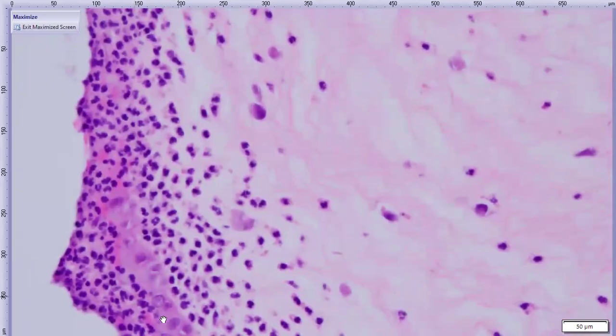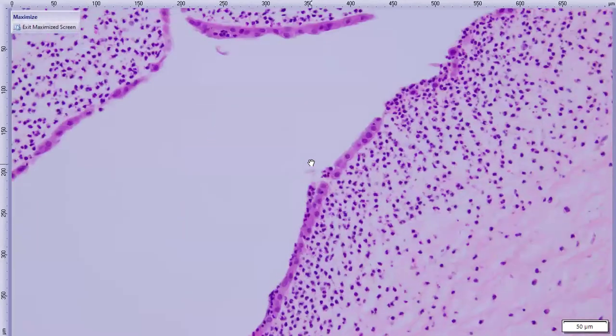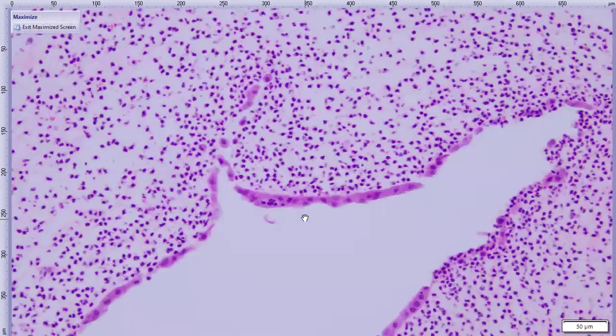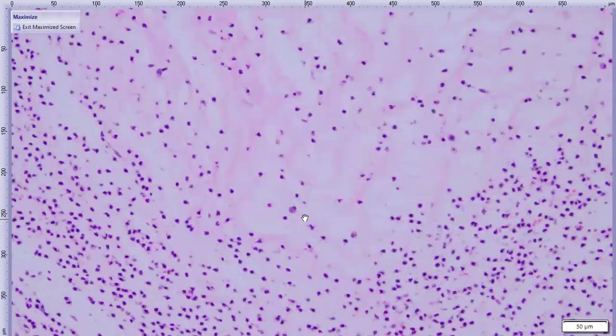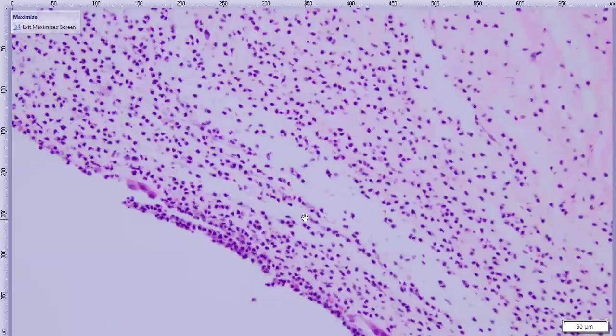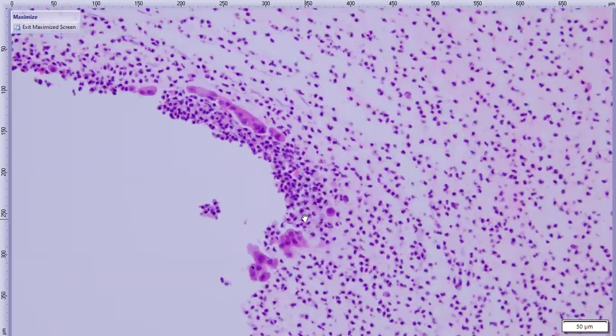And then a bunch of neutrophils, both in the epithelium, in the stroma, and sort of accumulating on that exposed corneal stromal surface. We do have little islands of epithelium, so they are trying their best to cover this area. I think probably because of the great expansion of the cornea, the number of cells just had to sort of try to spread out to cover the defect. But we do see little islands of them.